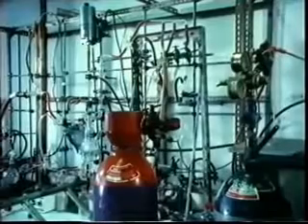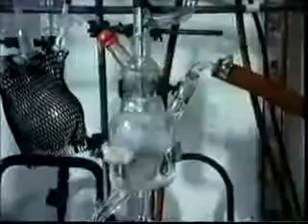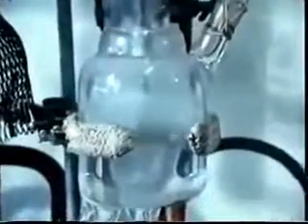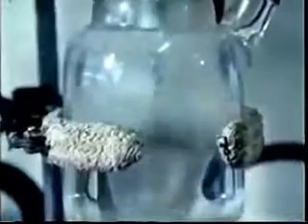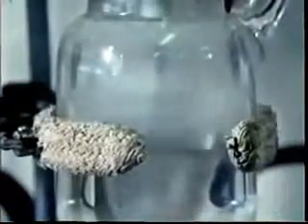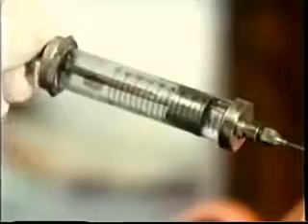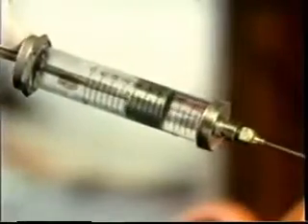Now, many other chemical elements and compounds will join onto ethene, and in fact, ethene will join onto itself. Here's a demonstration in the laboratory. This flask, which has to be completely free of air and water, contains a solvent, and ethene gas is being passed into it. If we add certain substances which act as a catalyst, ethene molecules will come together, joining on to each other to produce a new compound.